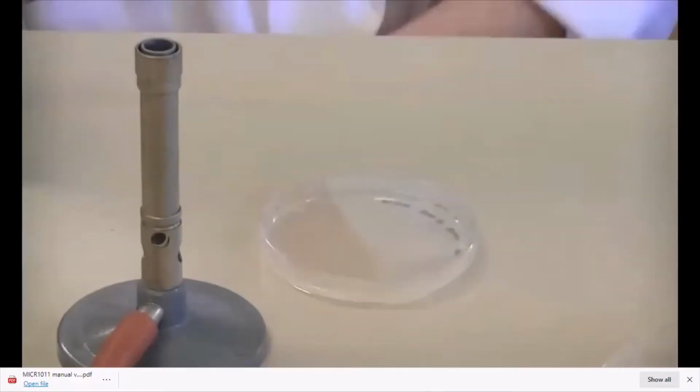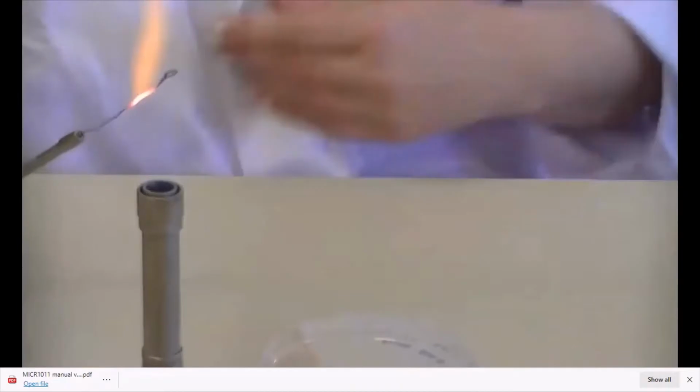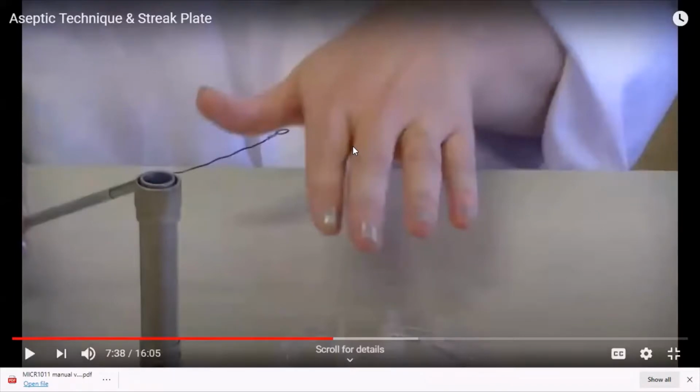And then replace the lid. And then again, you need to flame your loop. It's really important when you're streaking that you make sure your plate isn't exposed to the air for very long. After each set of streaks, it's important that you keep the lid not too far off the plate because you don't want to expose it to any microbes that might be in the air.